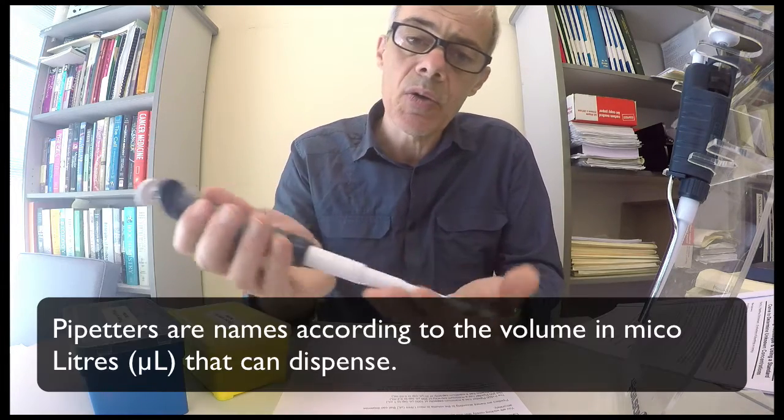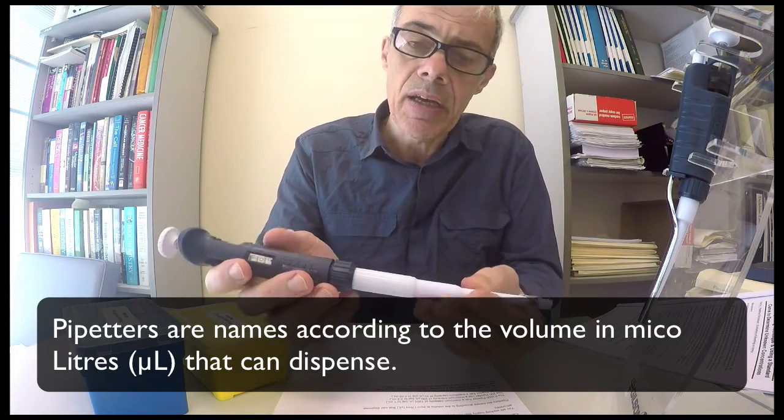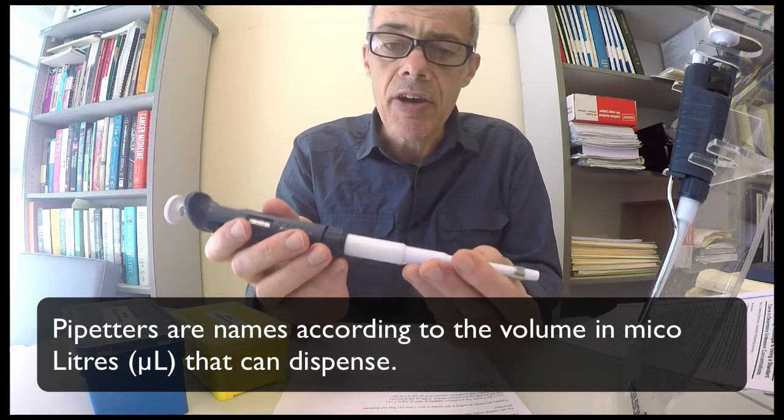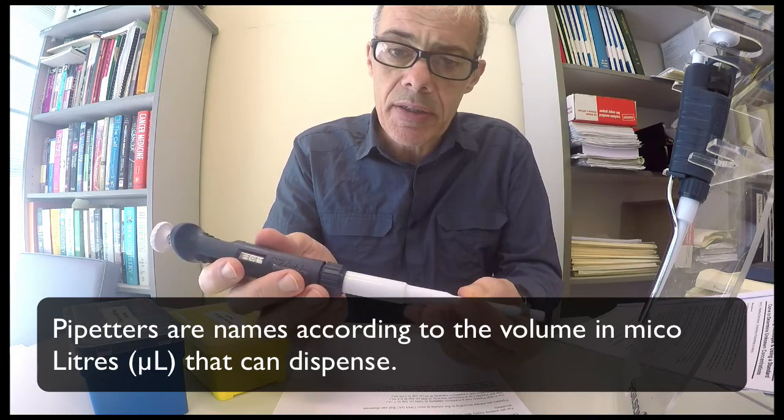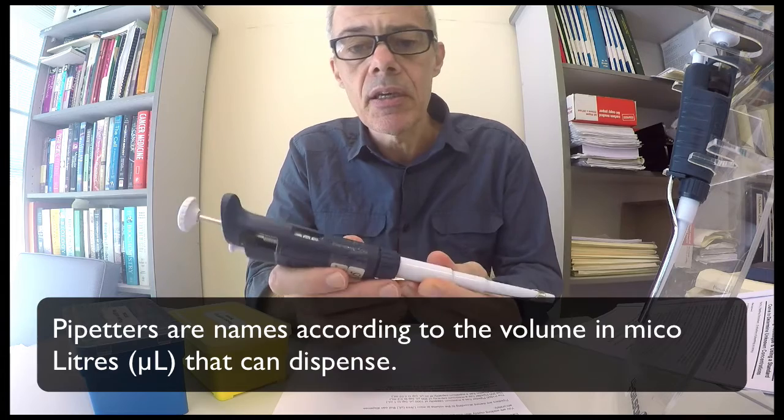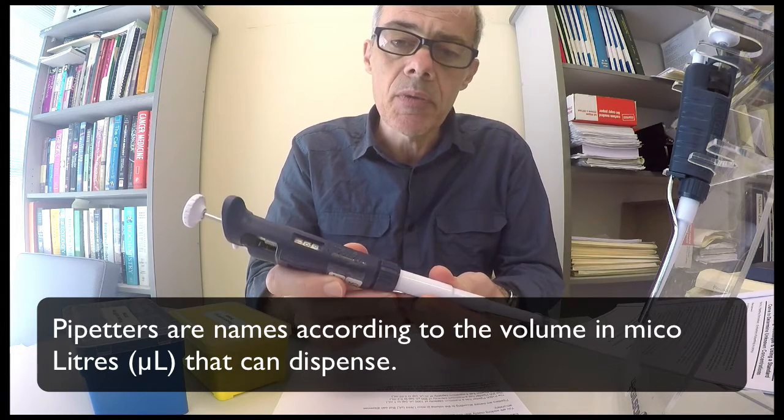So the P1000 can dispense 1000 units of something. That's 1000 microlitres. There are 1000 microlitres in one millilitre, therefore the maximum volume this can dispense is one millilitre.